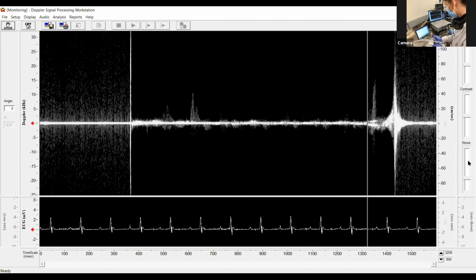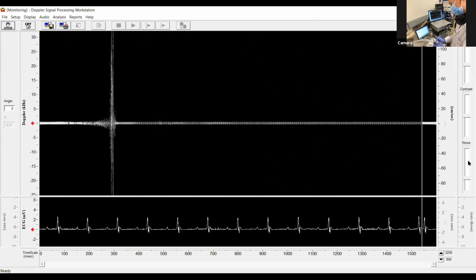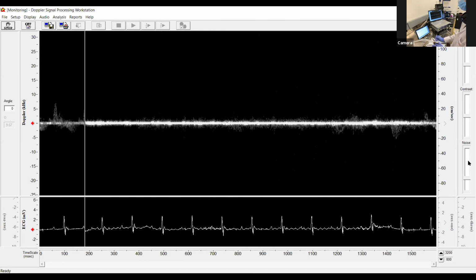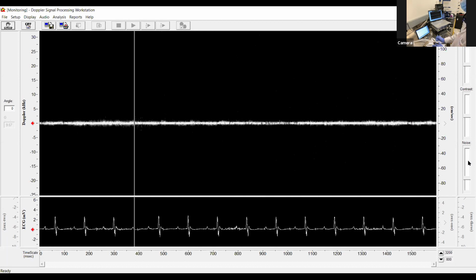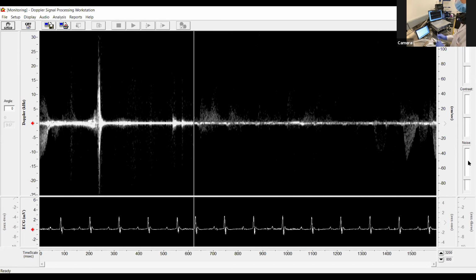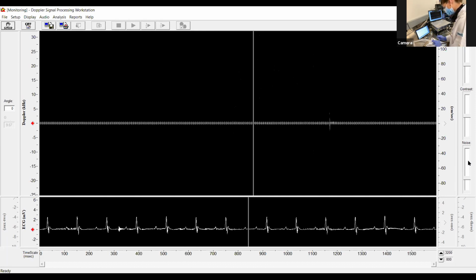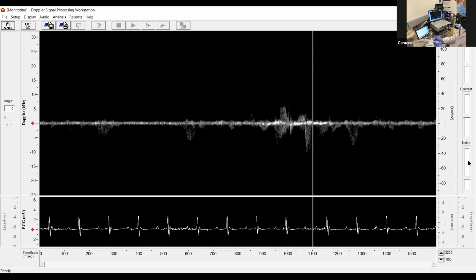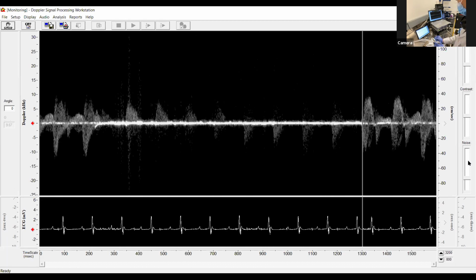So we do have one question. The question is, can you use and record from more than 2 probes at the same time? We have in the past had a system that had, I think, 3, and there is talk of a system that would have 4 probes simultaneously to look at flows through different areas. So that was something that was custom made, but obviously it's been made, delivered, and the customer is using it repeatedly. So it's something that we can definitely talk further about if appropriate, but yes, you can. Okay, if there's any other questions, we'd be happy to run through them.